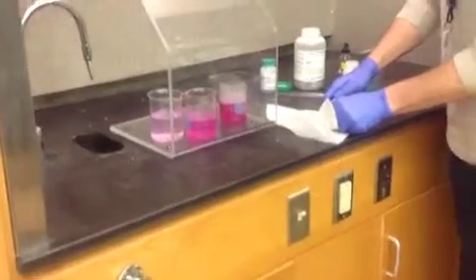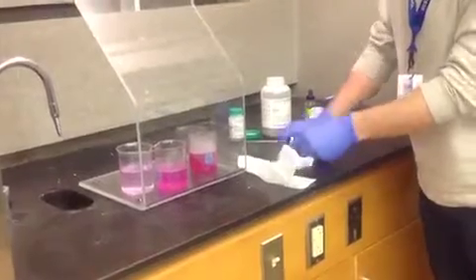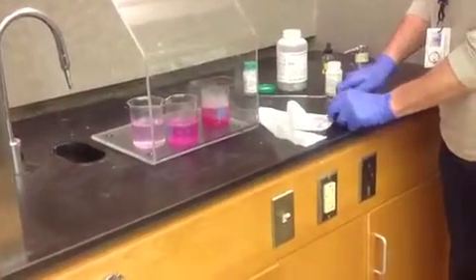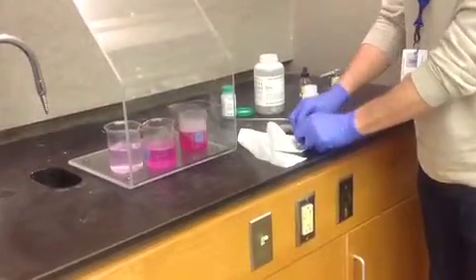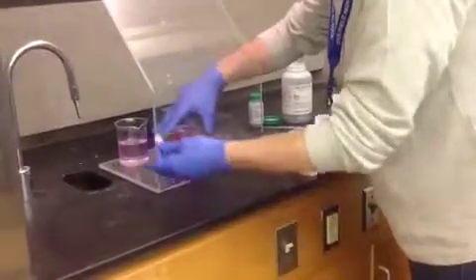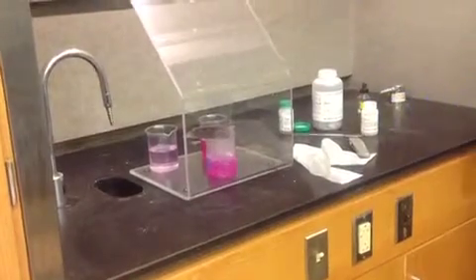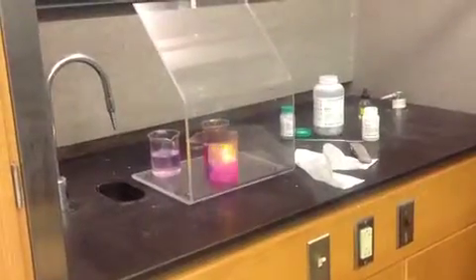Okay. Let's put a little bit bigger chunk of sodium in here, because everybody likes to see an explosion. So I'm going to put a little bigger chunk in here. Try to guarantee an explosion. I'm going to cut it open a little bit more. And this is why we do this in the hood, in the fume hood. All right. And that's why I've got this splash shield up here. Come on, give me my explosion. There we go.